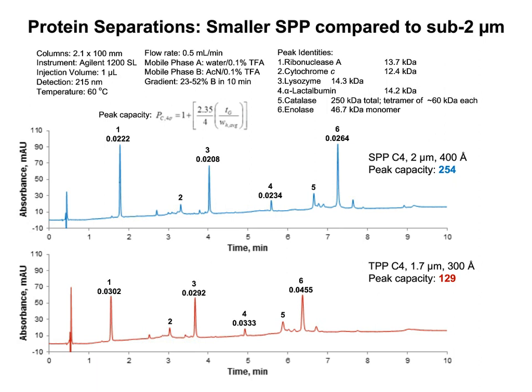So you can see that just decreasing the particle diameter does not optimize protein separations. It requires consideration of the diffusional limitations because proteins are large. Diffusion dominates the ability to resolve such large biomolecules. The diffusion limitations are decoupled to some extent by the use of a superficially porous particle morphology.